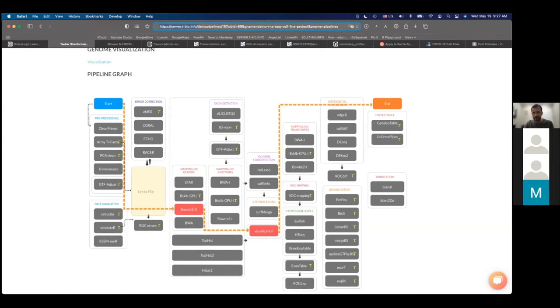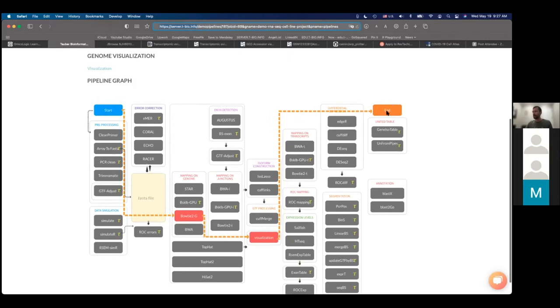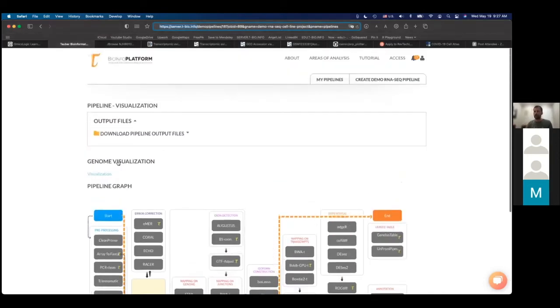Okay, Mohit is saying 32 million. So what is a billion? Okay, I won't torture you, but you can appreciate now the difference between millions of positions and billions, right? 3.2 billion. There is a huge difference in how many positions we have to survey to find the best mapping place for a short read. And so instead of using Bowtie 2G, let's start another pipeline to see what that would look like. We can actually map our data onto the transcriptome.